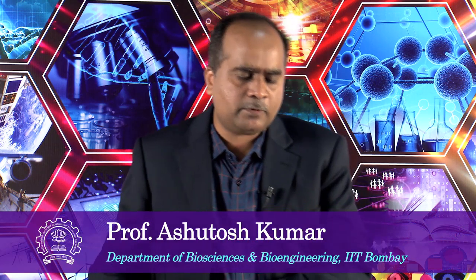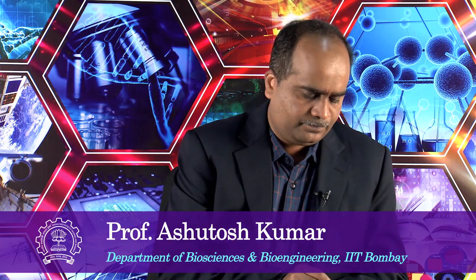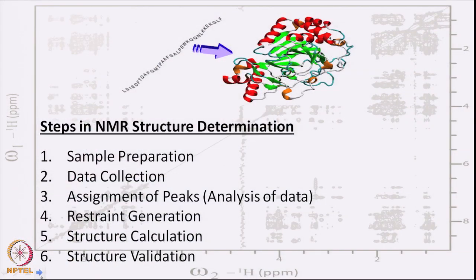So we were discussing structure determination of peptides by NMR spectroscopy. Just to repeat what we did in the last class: we have a primary amino acid sequence, and we want to translate that sequence into how this polypeptide will fold into a three-dimensional structure. For shorter peptides of 20 to 50 amino acids, we can get the three-dimensional structure using NMR spectroscopy as a tool. So that is what we were discussing.